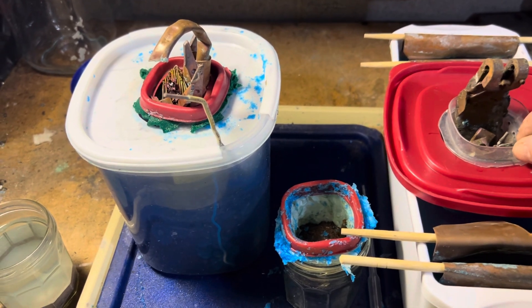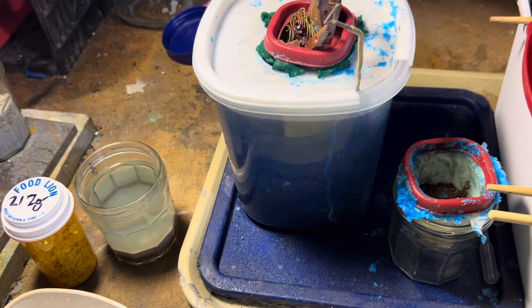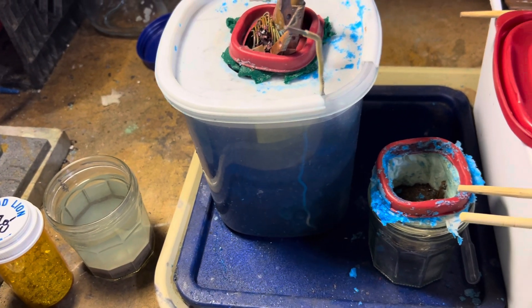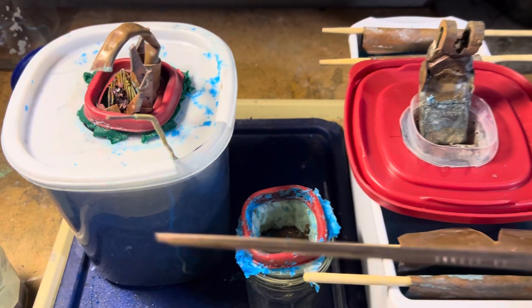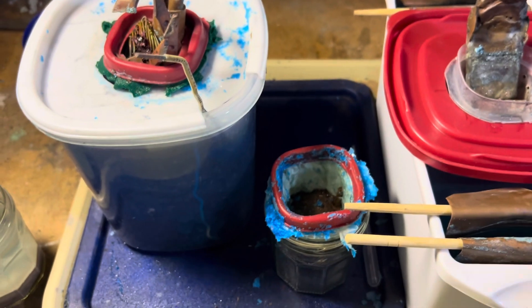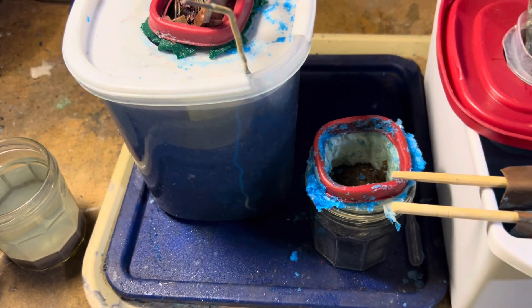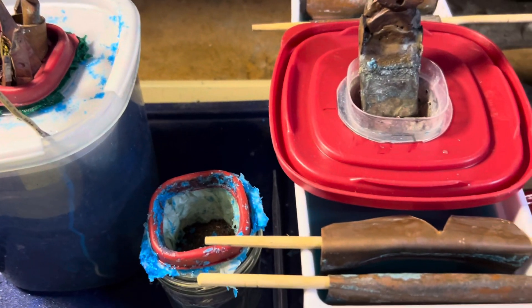This here is going to be your anode basket. What I did here was I have taken silver plated stuff. This is silver solder that's common in the air conditioning trade. I melted and poured a bar here to recover the silver out as slimes.